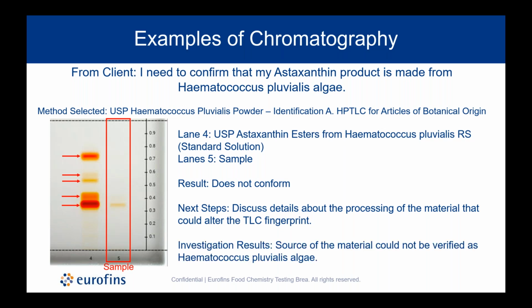In this case, after the investigation of the results and looking into what the client's goal was, the ultimate outcome with this was truly out of specification for Haematococcus pluvialis algae, and the identity could not be confirmed as being from that algae based on this USP method.